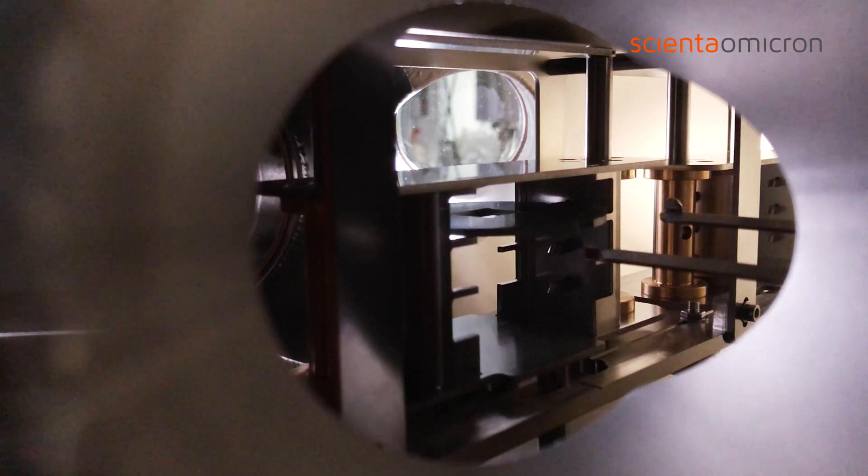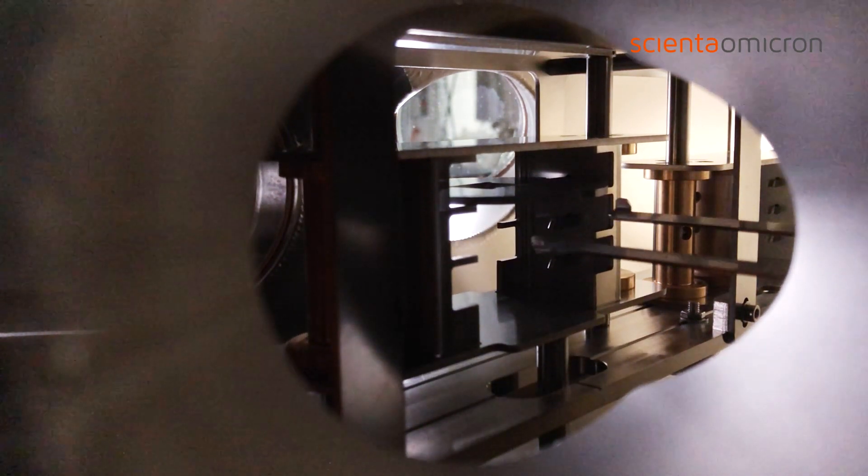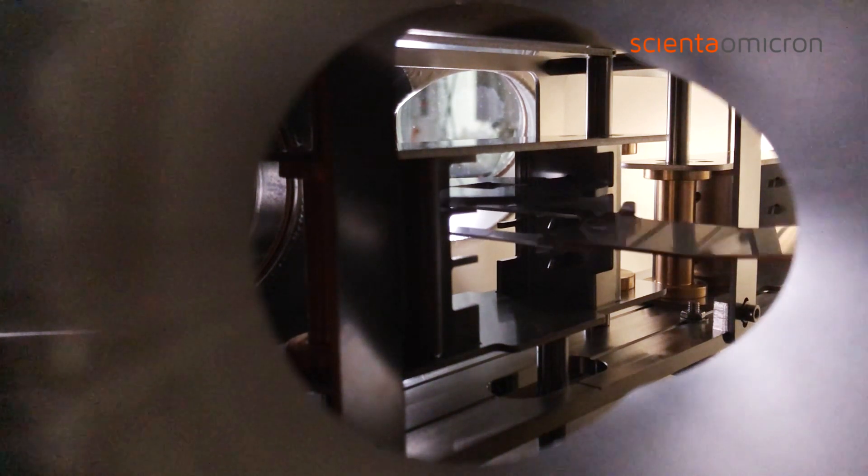The trolley accepts multiple sample plates or wafer carrier rings. For example, in this configuration, six 2-inch carrier rings are shown being loaded into the trolley.